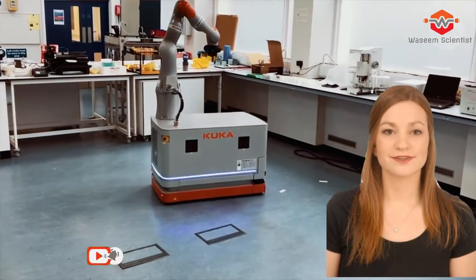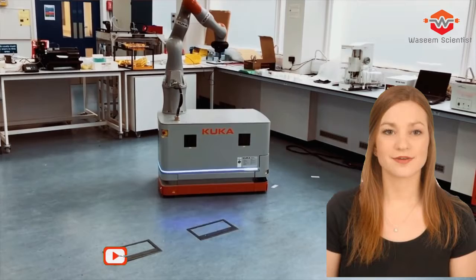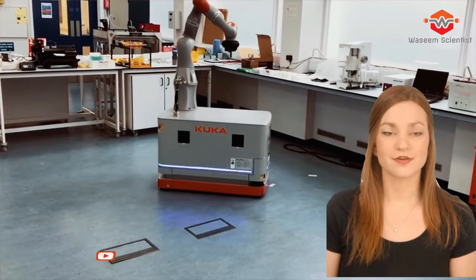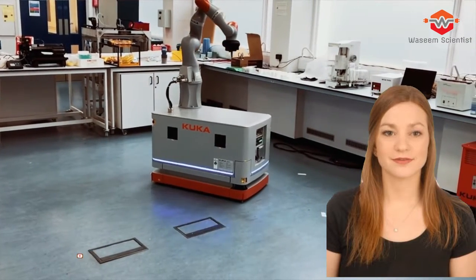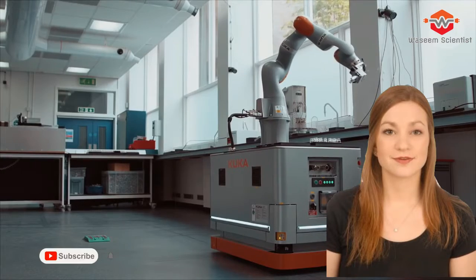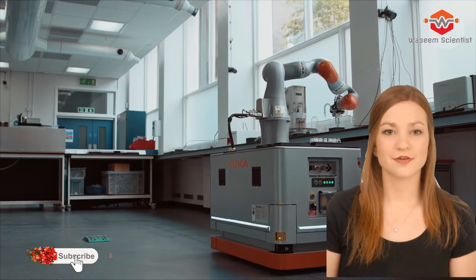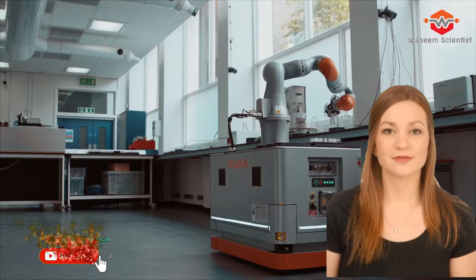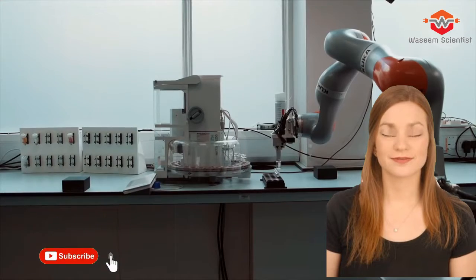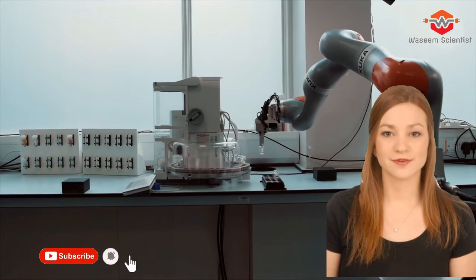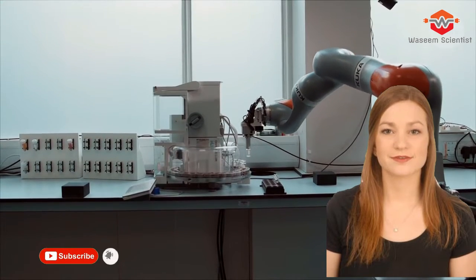Engineers at the University of Liverpool have developed a robot scientist that can autonomously perform experiments, analyze results, and decide what to do next. And it's already making new discoveries.